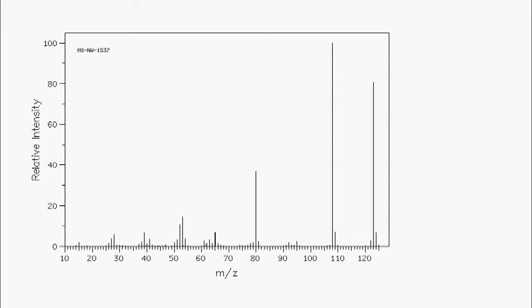We begin by looking at the mass spectroscopy data presented before you. The mass spectroscopy shows the relative presence when this molecule is broken down into ions and their relative prevalence, and as a result, stability in a compound.